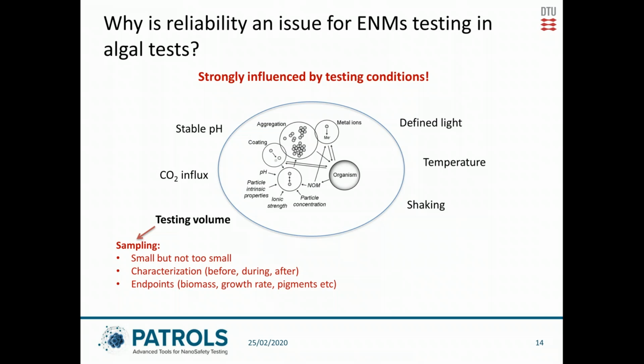This could be standard biomass like cell counting and so on, but it can also be things we're working on in PATROLS, other types of endpoints where we are focusing a lot on algae pigment content.